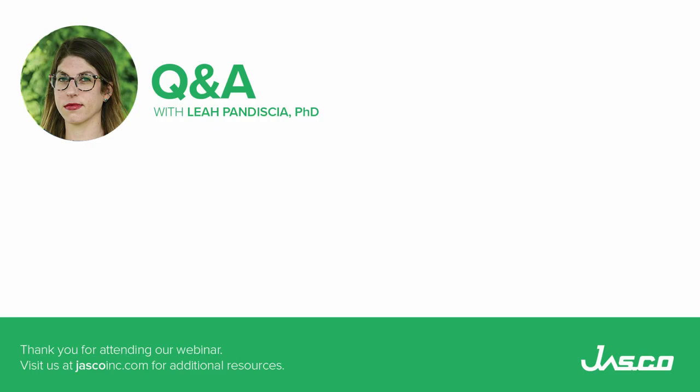It might take more to clean it, especially if you're using small volumes, but the black masked quartz is really the best way to go for your micro volume measurements if you want high data quality. Right. And it's hard to generalize some of these questions because there are so many different applications for UV, so it really will depend on that application.